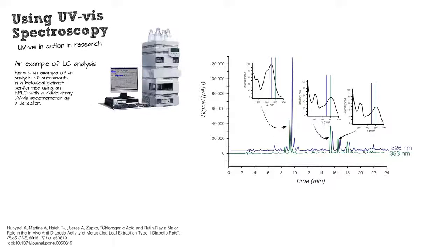Now here's the slices I took. Each of these chromatograms was looking at a particular wavelength over time. Well, here's 353. Notice how 353 is the maximum absorbance for this particular compound, and it's lower at 326. But it's near a minimum here and increases greatly when we look at 326. So that's why we had such a different behavior.